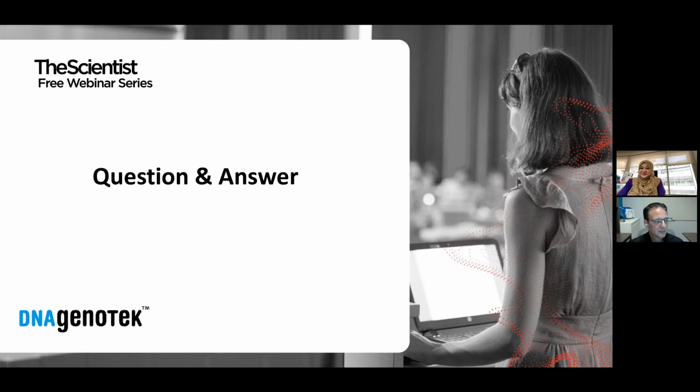Perfect, thank you so much. Have another one for you, Mike. With the 50-degree incubation prior to extraction, does it require an addition of a proteinase K treatment?